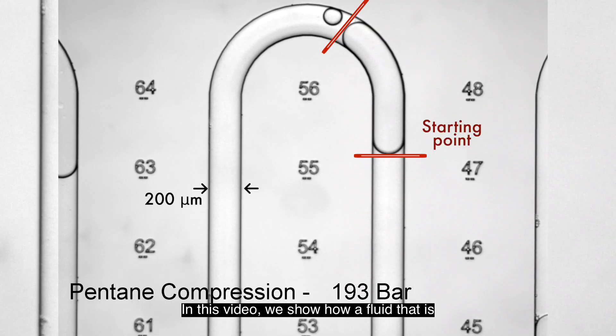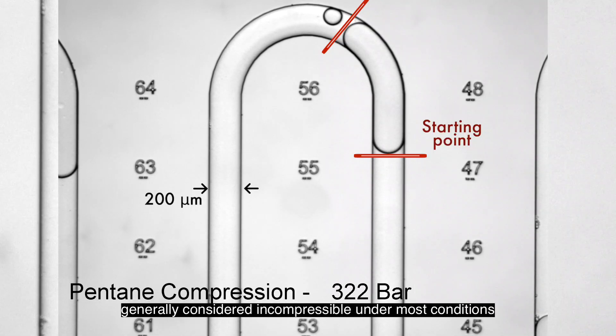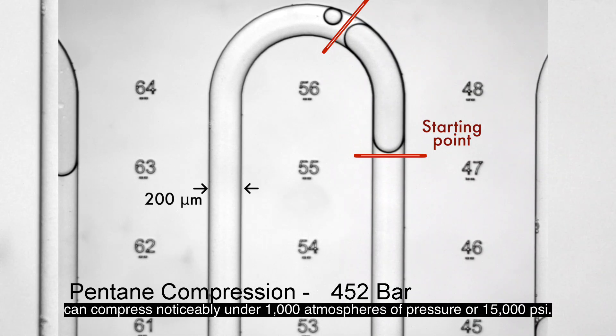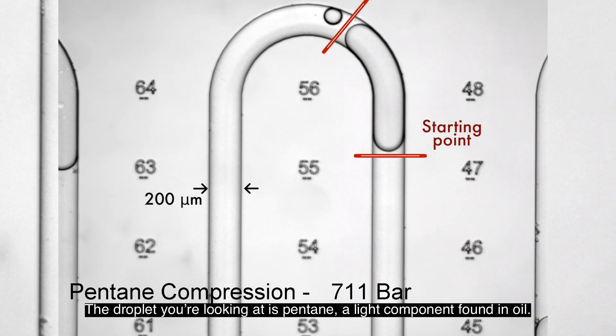In this video, we show how a fluid that is generally considered incompressible under most conditions can compress noticeably under 1,000 atmospheres of pressure, or 15,000 PSI. The droplet you are looking at is pentane, a light component found in oil.